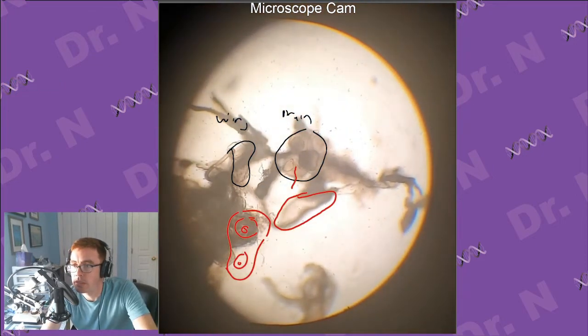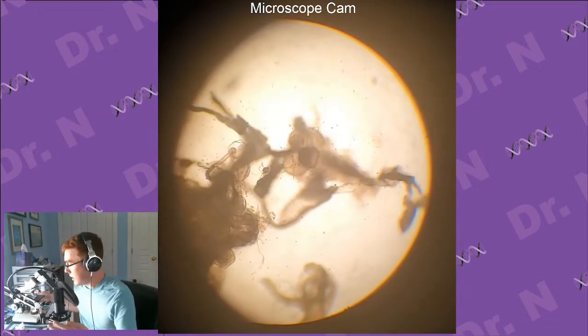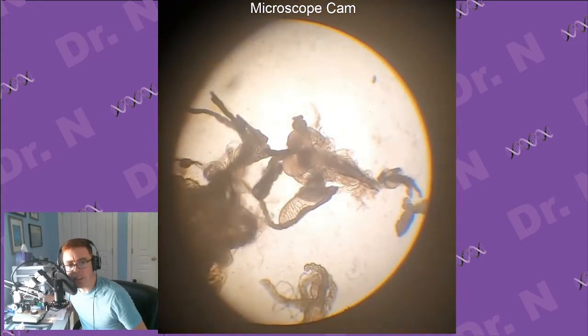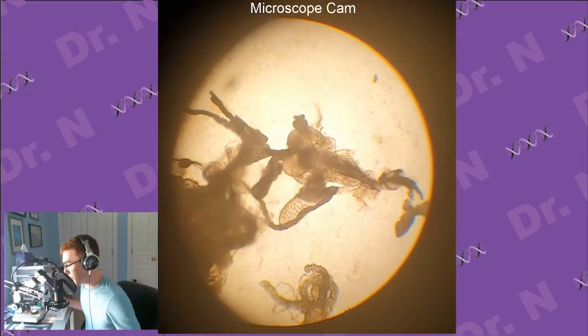Whoops. Get rid of all this stuff. There. Let me play with the zoom level a little bit. Yeah, actually that's the salivary gland right there. It's the sac that's kind of in the center of the screen at the bottom. So if I can just get that separated, then I'm good to go.